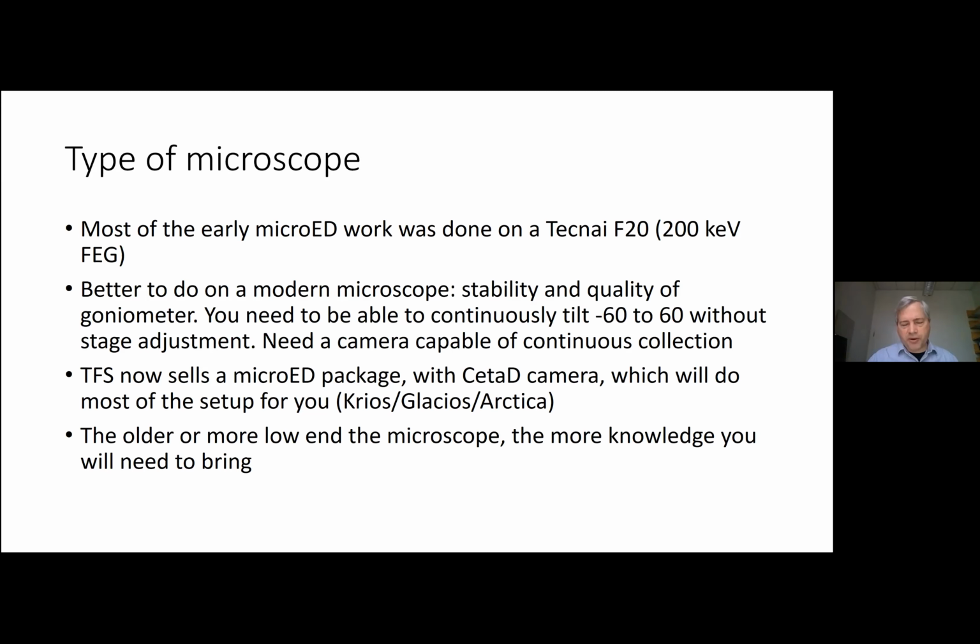Thermo Fisher has now commercialized this. They sell a MicroED package, which I think comes with the software and a CMOS camera. The MicroED package basically does most of the setup for you, and it's for Krios, Glacios, or Arctica microscopes. So that can be one way to go. You don't really have to do very much, because basically the engineers will calibrate everything for you and make sure it's all working.